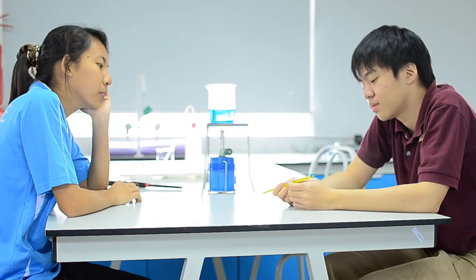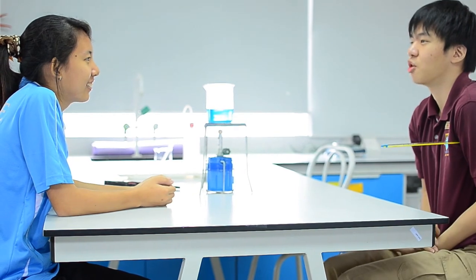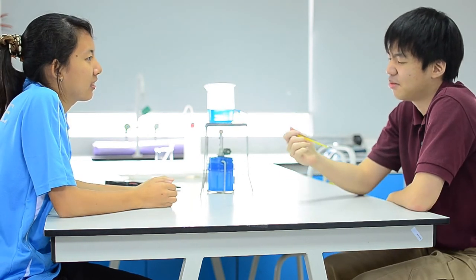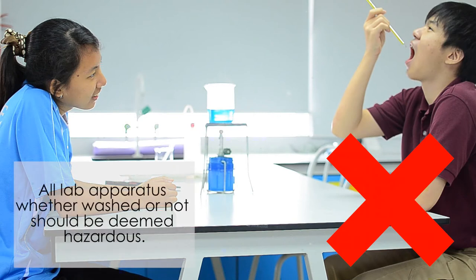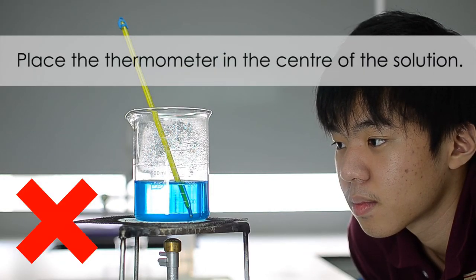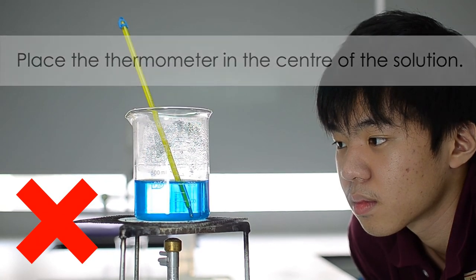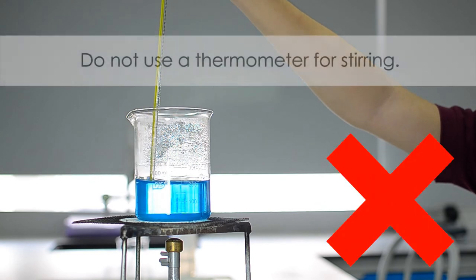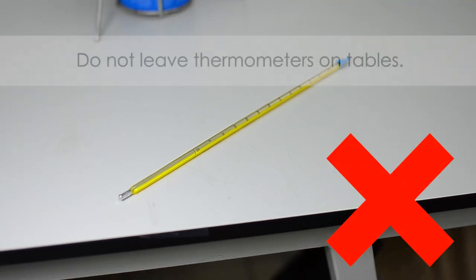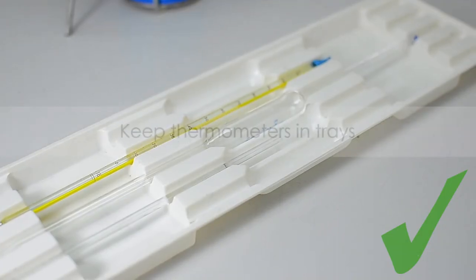Is it possible to measure your body temperature using a thermometer? It's never a good idea to place a laboratory thermometer in your mouth because you might end up with a really bad stomach — or dead. The thermometer bulb should not touch the beaker or the heating source; it should always be placed in the center of the solution. Do not use a thermometer to stir liquids — use a glass rod instead. Thermometers might roll off flat surfaces, so keep them in the trays provided.